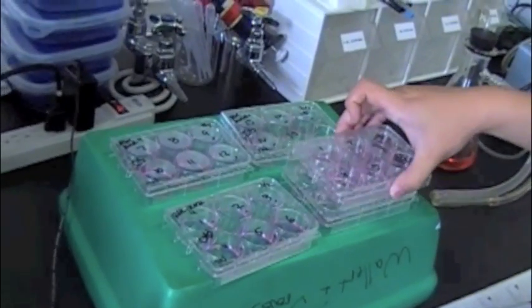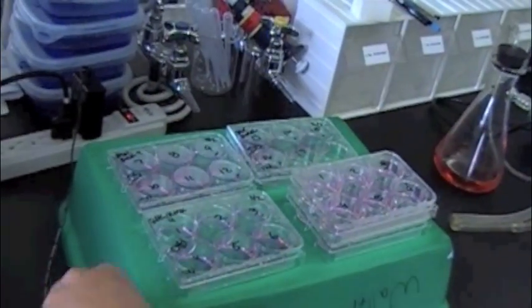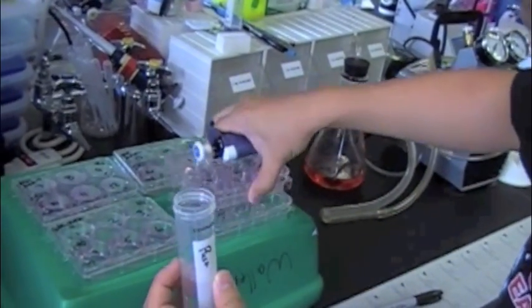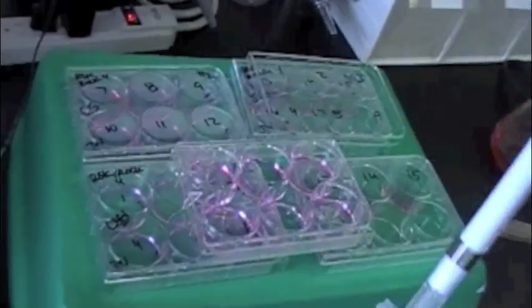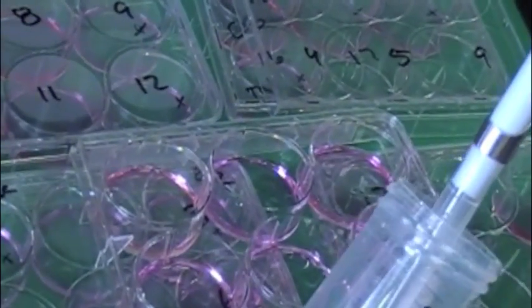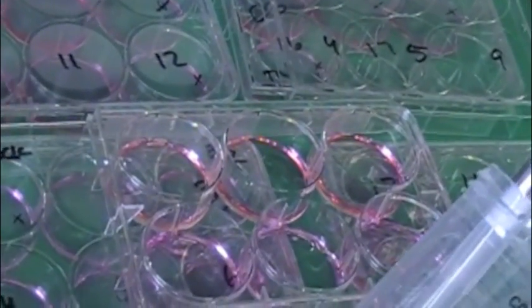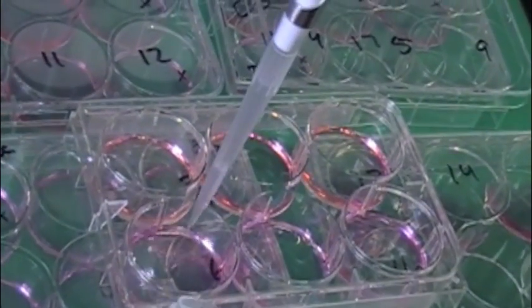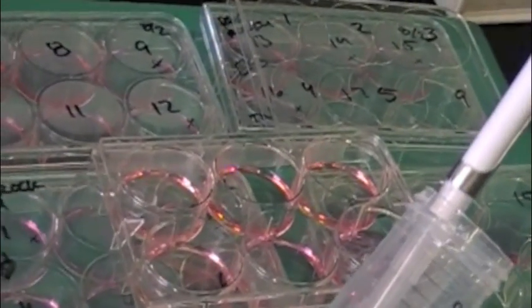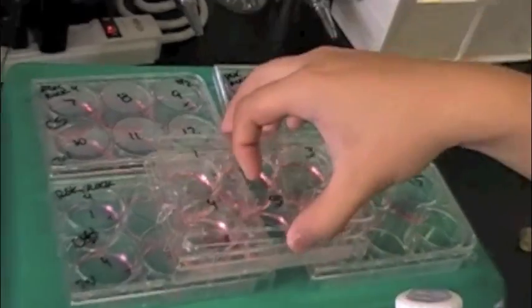Once you have the media transferred from your old wells to your new wells, add about 1 mL of 7.4% paraformaldehyde in 1X PBS to each new well, bringing the total volume to about 2 mL. You also want to make sure that the paraformaldehyde is warmed to about 37 degrees prior to fixing — this ensures that the cells are still adhering to the cover slip during the process.